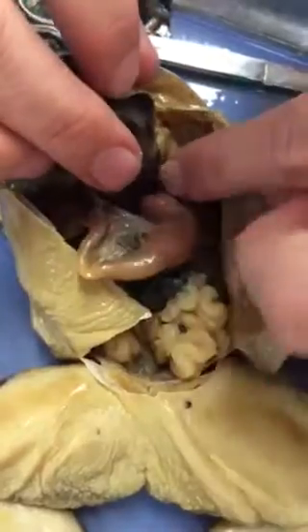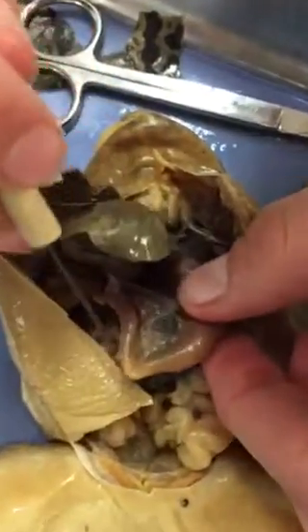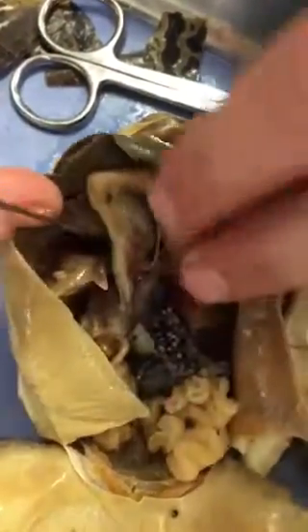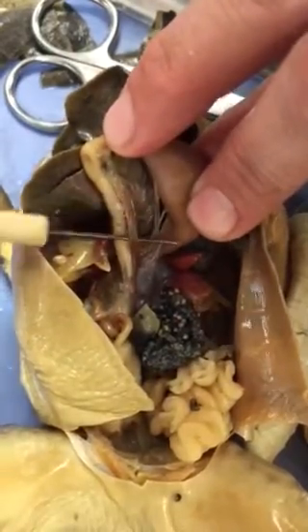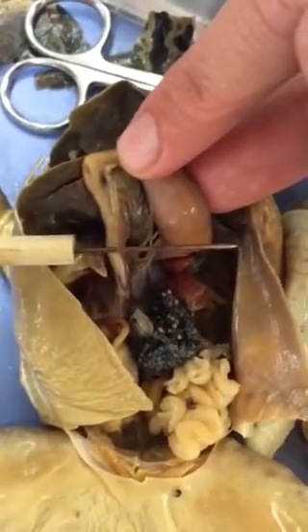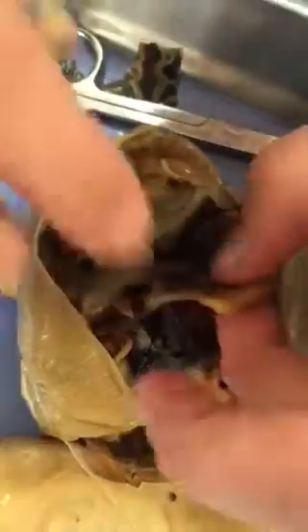Lift up the liver. Here's the stomach. The stomach, when it begins to bend, turns into the small intestines. But right here between them, you're going to find the pancreas. So this very small structure right here is the pancreas. I'll probably have a probe underneath it just like that. So stomach, small intestines, pancreas.